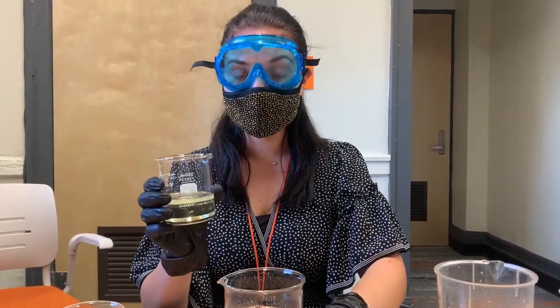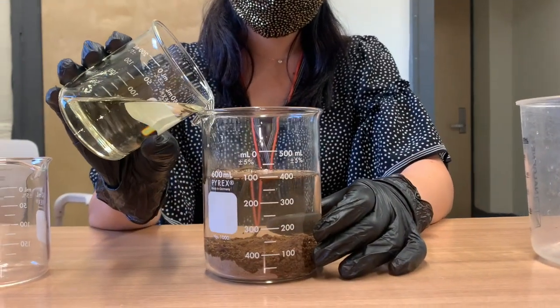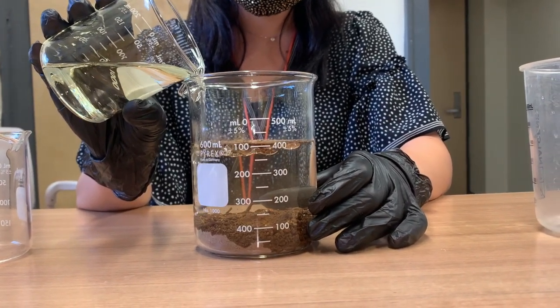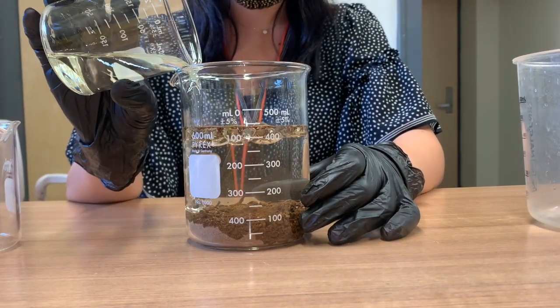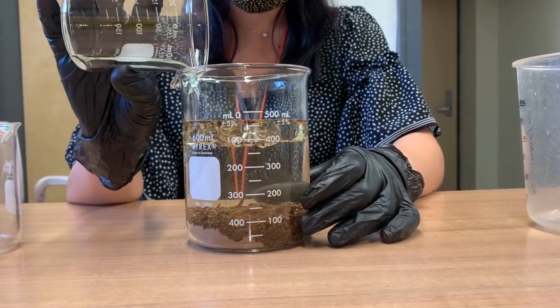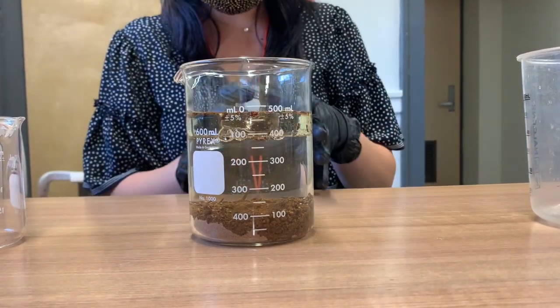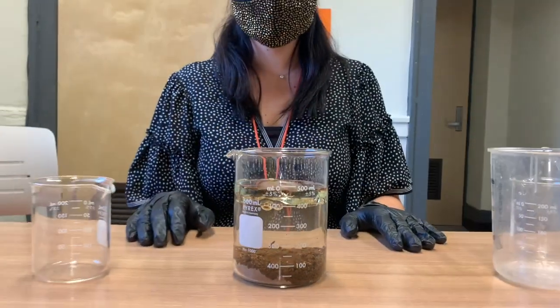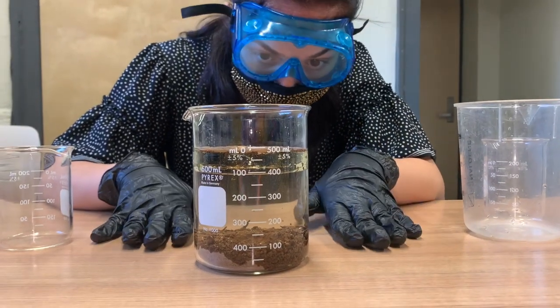Now we're going to take oil and we're going to put it at the top. Look at that. You have all three layers completely separated.